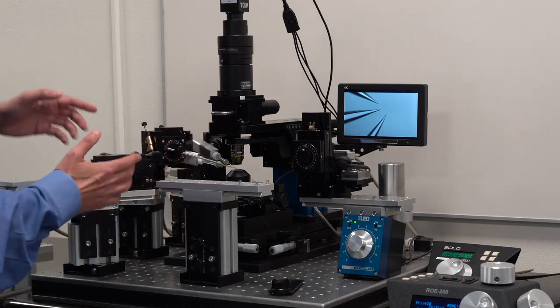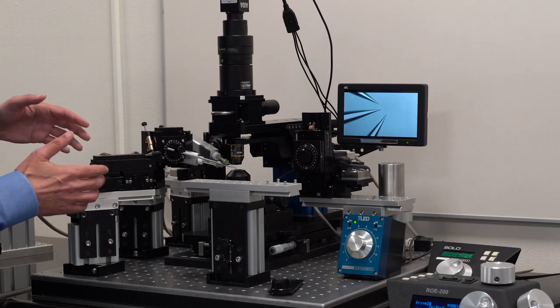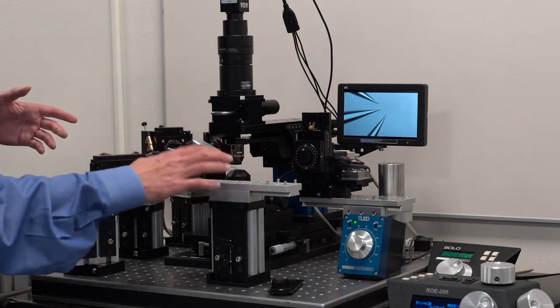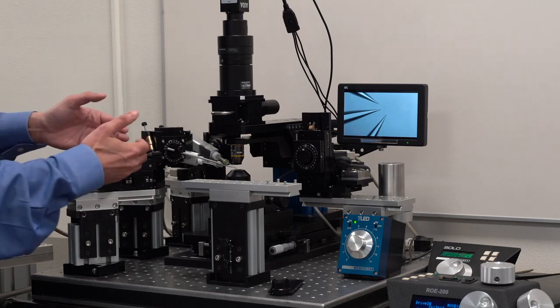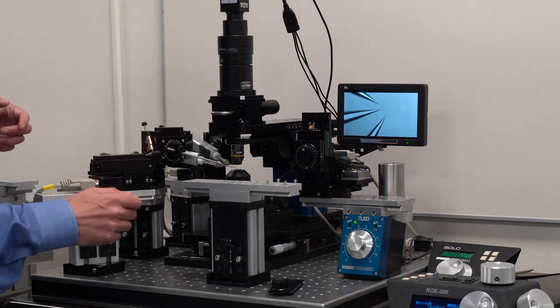In this case, because the X-axis travels 50 millimeters, I don't have the need to pull these back. Just that action of 50 will give me enough room to change pipettes.